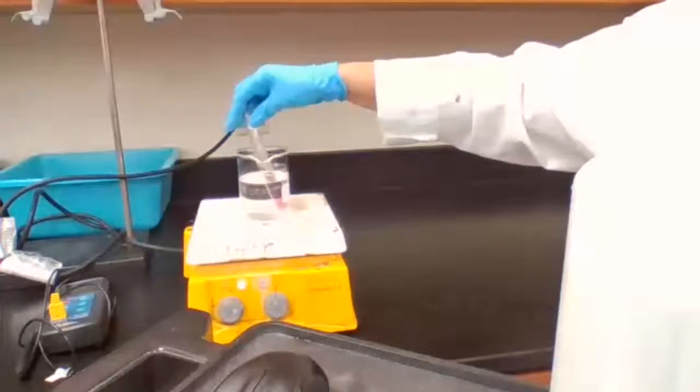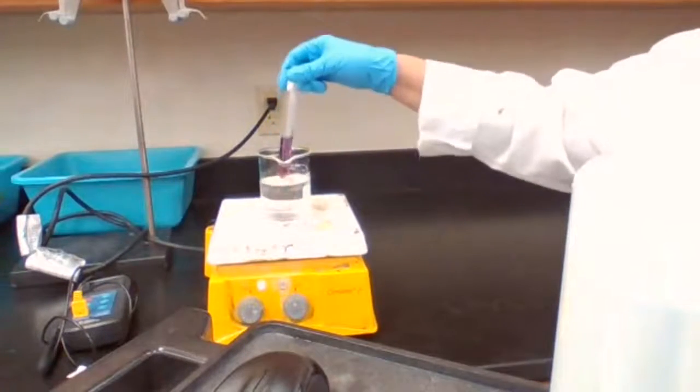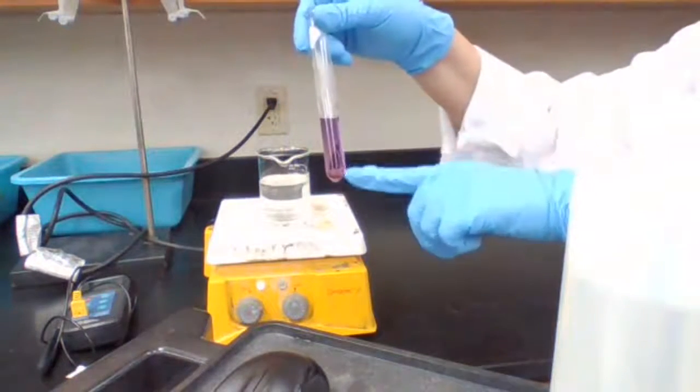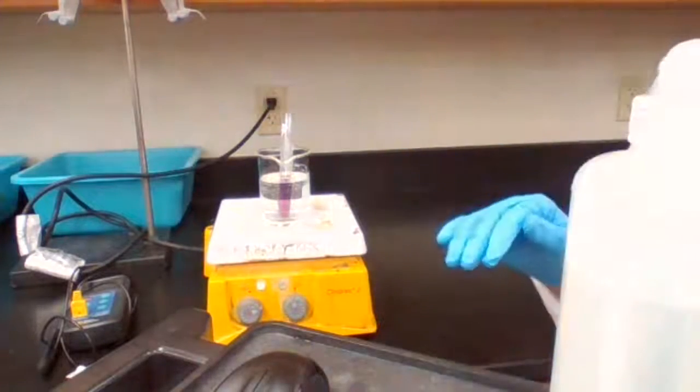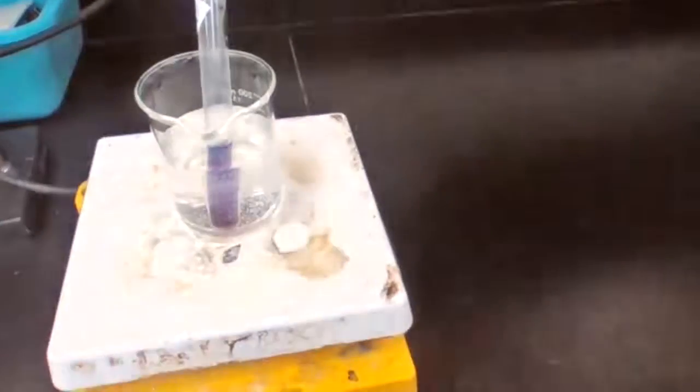Okay, I want you to see that there is a change in color happening in the test tube. Gradually, you see the top portion is blue, the bottom still is pink, but we are going to continue until no more color change is happening. So I'm going to bring the camera closer so you can see the color change. Color change is taking place in the test tube.